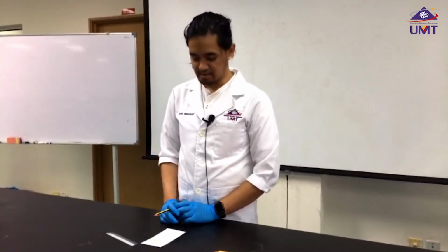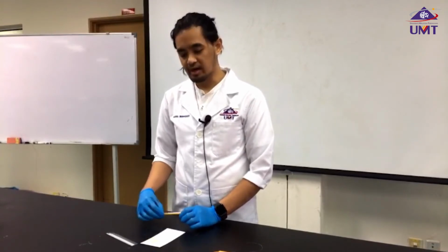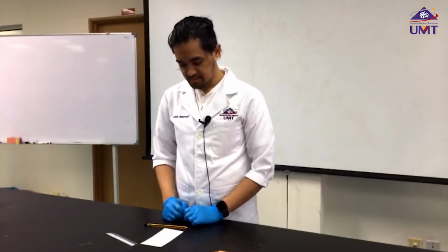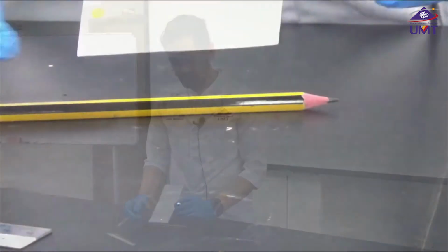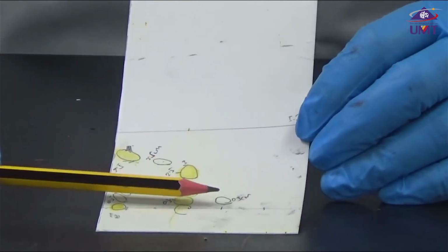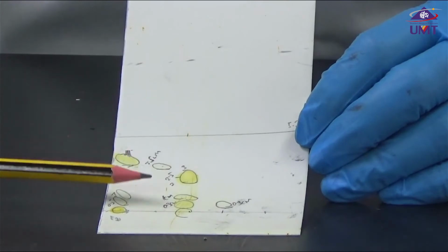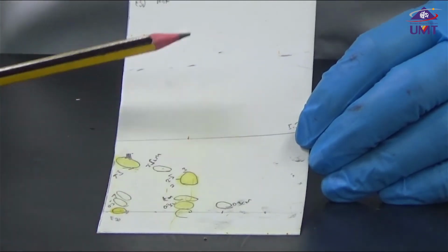Based on the formula given, we need to calculate the distance, and then from here work out what components are present inside our samples. Straight away, by looking here, we know that our egg sample also contains cholesterol, but our milk does not.